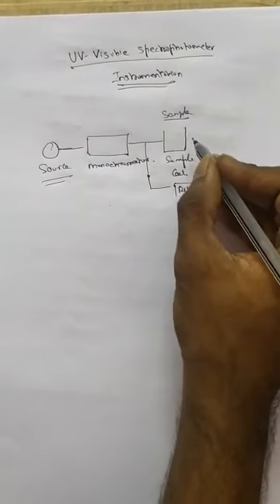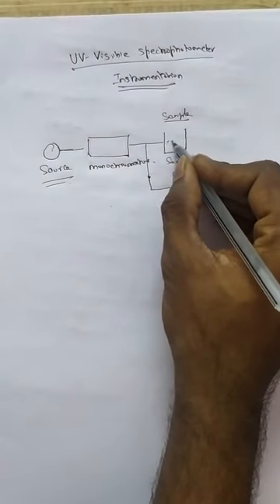For example, the same light is split into two, and one part is passed into a reference, normally a blank, which gives a correction. Sometimes the blank may show some absorption. To rectify that absorption, a blank is kept, and after the light goes into the sample, the light that is coming out is allowed into a detector unit.